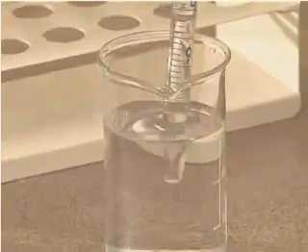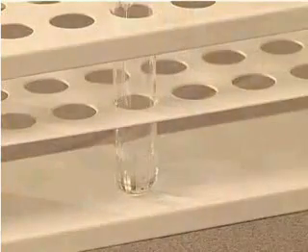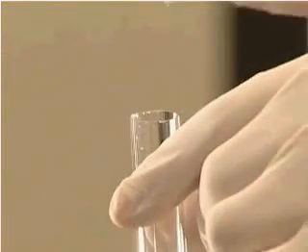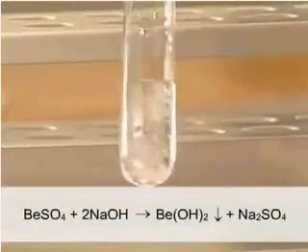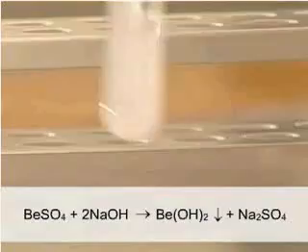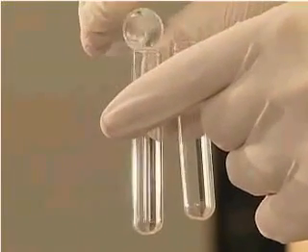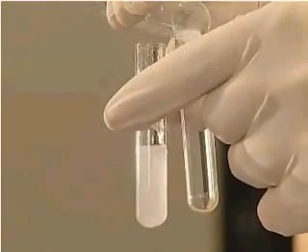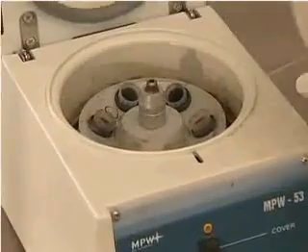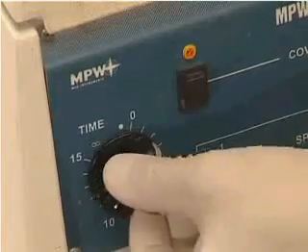Let us investigate the amphoteric properties of beryllium hydroxide by means of an experiment. We add about 5 cubic centimeters of beryllium sulfate solution to a tube, and then add sodium hydroxide solution drop by drop until a precipitate falls. We divide the suspension obtained into two parts, and separate the precipitate of beryllium hydroxide from the solution by centrifuging.